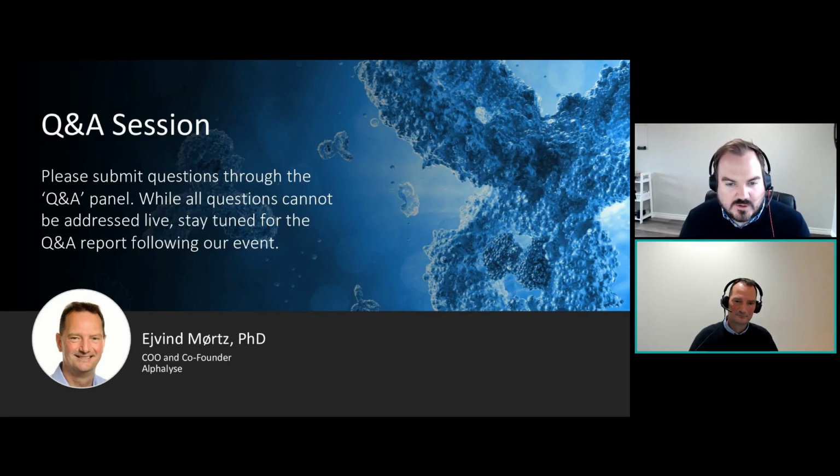Okay, wonderful. I think you've touched on this question a bit already as well, but did you create in-house DDA, DIA libraries for all of the expression systems?